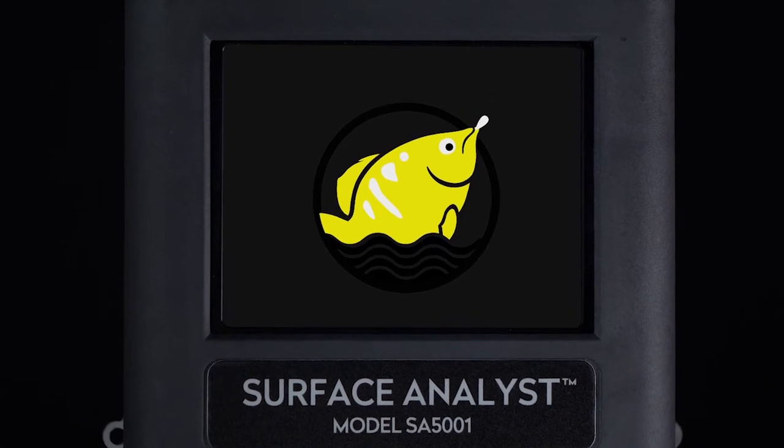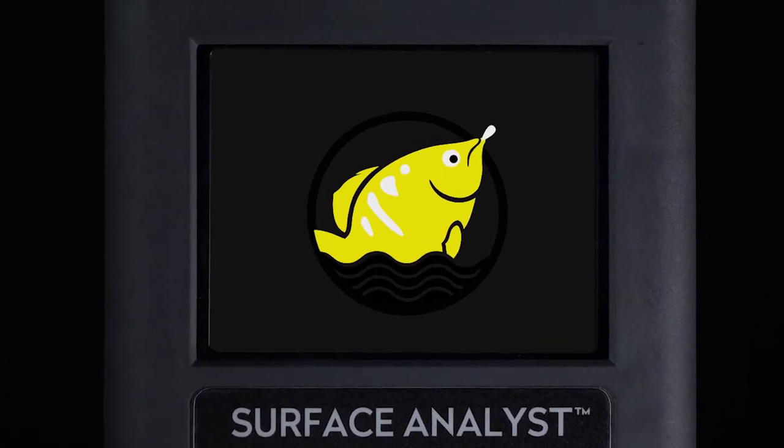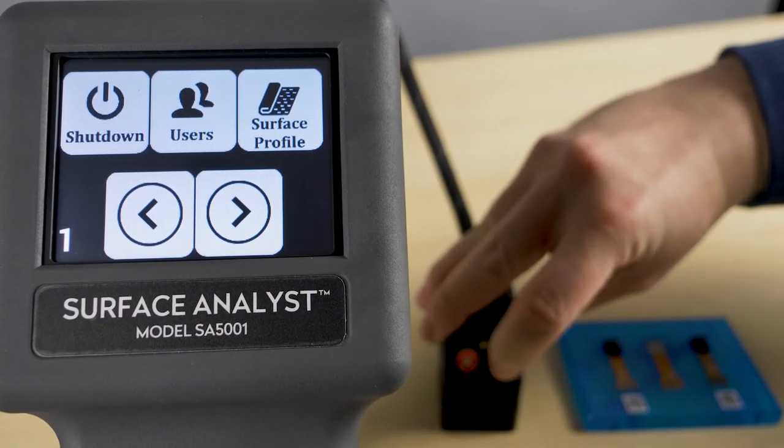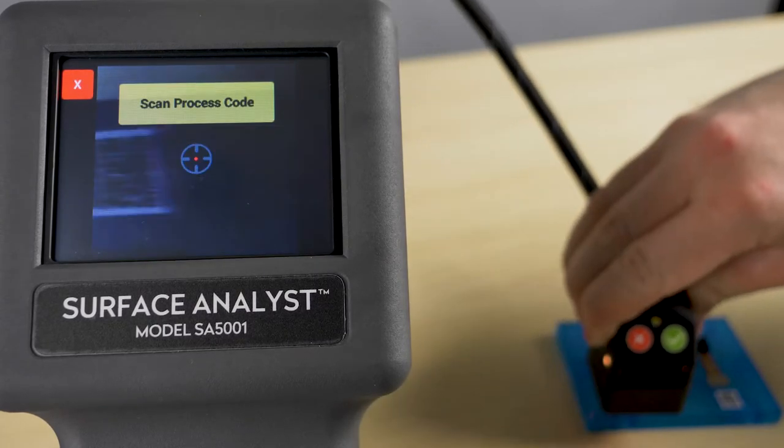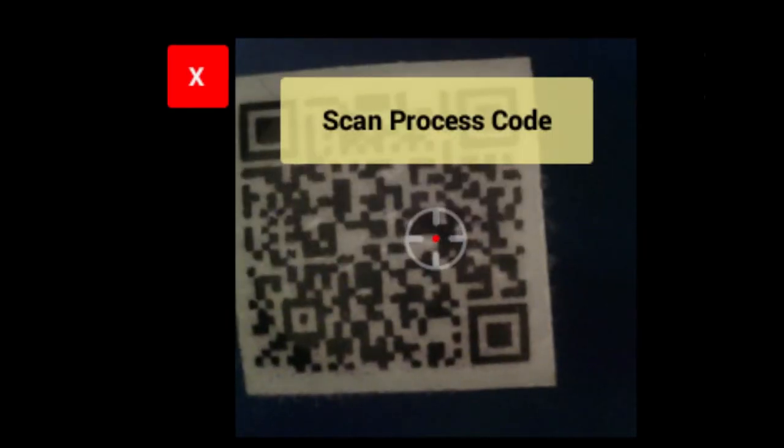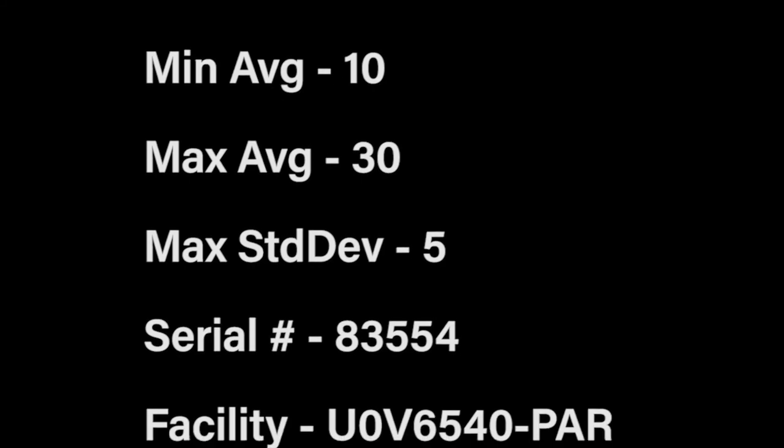ARCHER, the powerful software that powers the device, streamlines surface adhesion inspection processes and new product development by providing precise and quantitative inspections free from subjectivity.